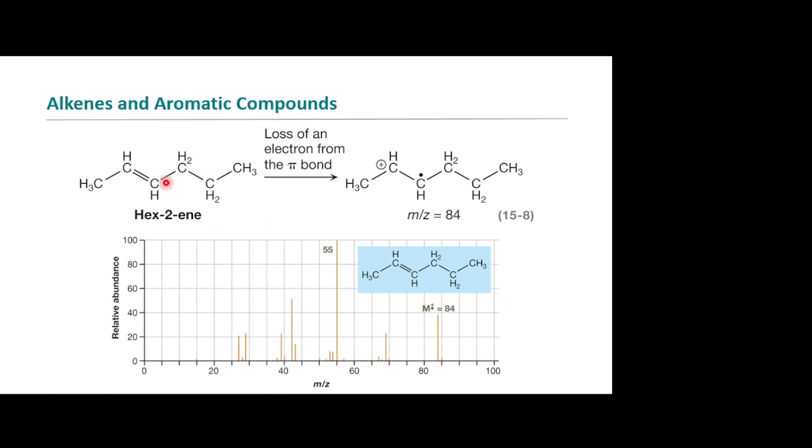Okay, so this one right here is going to be an alkene. And so what we see here is when we put the positive charge on it, we actually end up with a very stable M plus that's not fragmented, right? And so what you see is your M plus ends up being one of your larger, more stable species. And that's why you see that one's almost like a 50%-ish, right? There's still more stable spots like that, but this is very stable because you can actually just break this double bond, can't you?